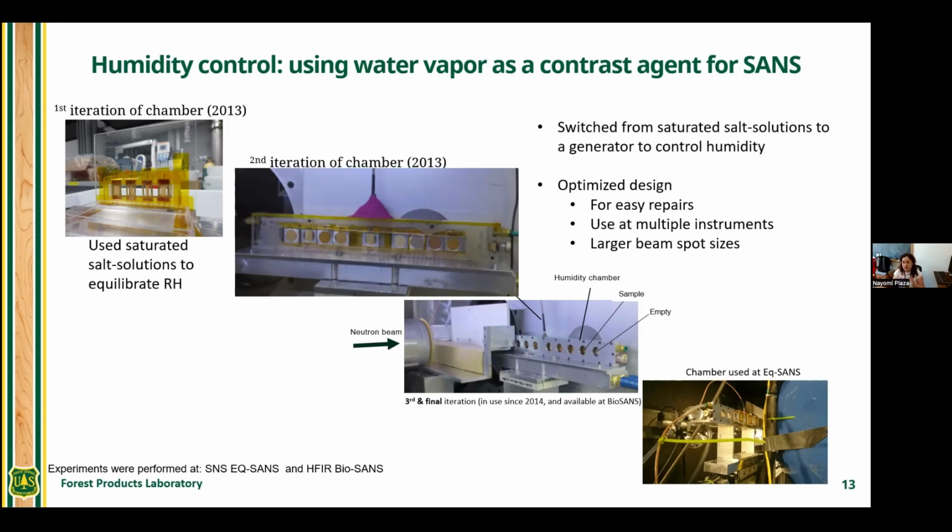having a larger sample chamber like that that took advantage of the translation stage was critical for us, since the longest time we're spending is just equilibrating the samples. That allowed us to equilibrate many more samples at once. Once we had reached equilibration by tracking the scattering of one of the samples, we could go to our next samples and just measure all of them. So that worked really well. We also learned that having a really, really long piece of quartz was perhaps not the greatest, since despite the fact that it did not look like it touched anything, it cracked.